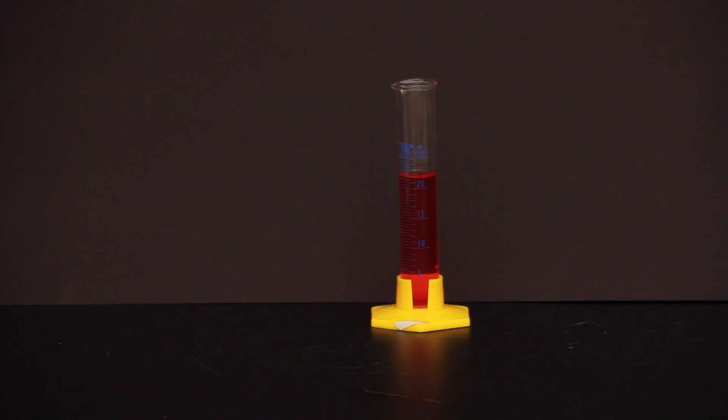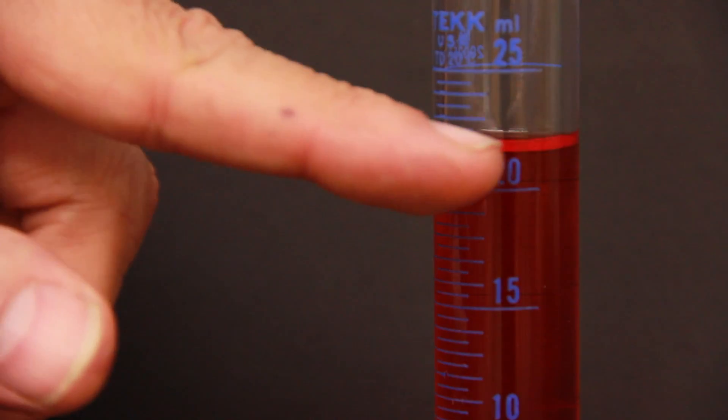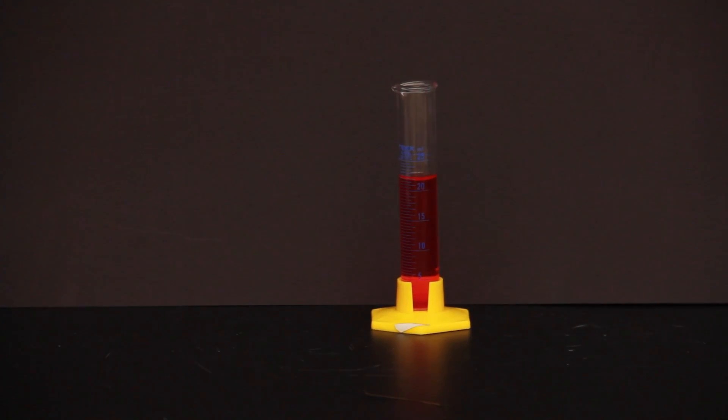It is also important when using a graduated cylinder to properly read the volume of the liquid inside the cylinder. When a liquid is in a cylinder, it has a tendency to creep up along the sides. This forms a curved layer called a meniscus. To accurately read the volume of a graduated cylinder, you always read the bottom of the meniscus.